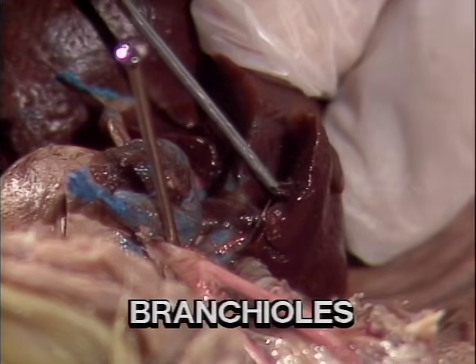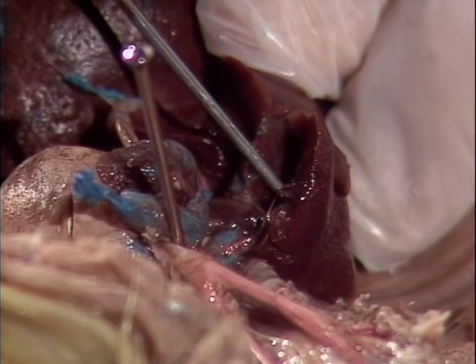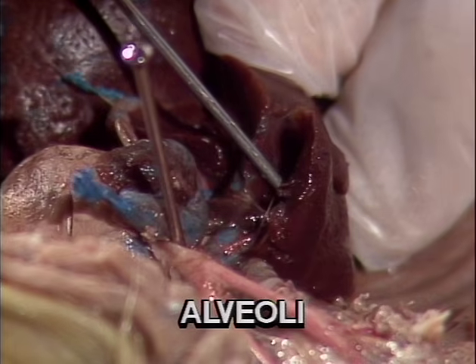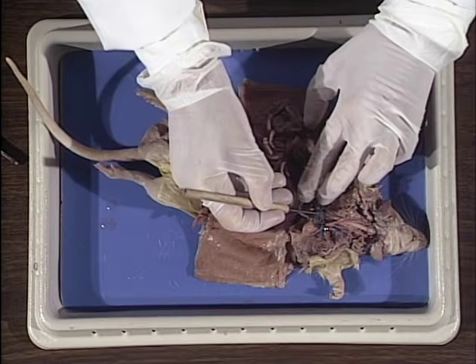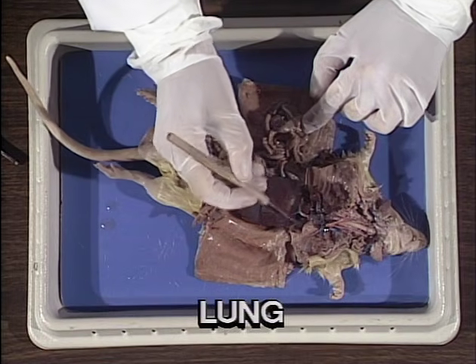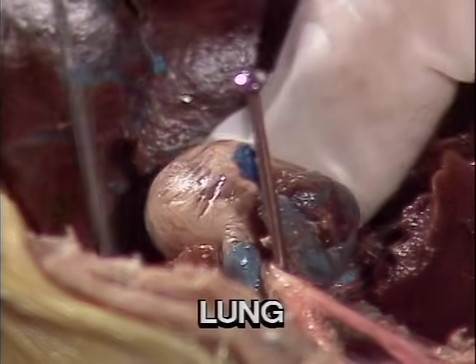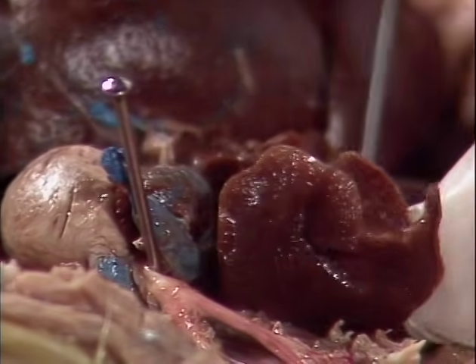It will continue to branch and rebranch until it gets into its final division known as alveoli. It is here where the gas exchange occurs. The rat has a 5-lobed lung. It has 1 left lobe and 4 right lobes.